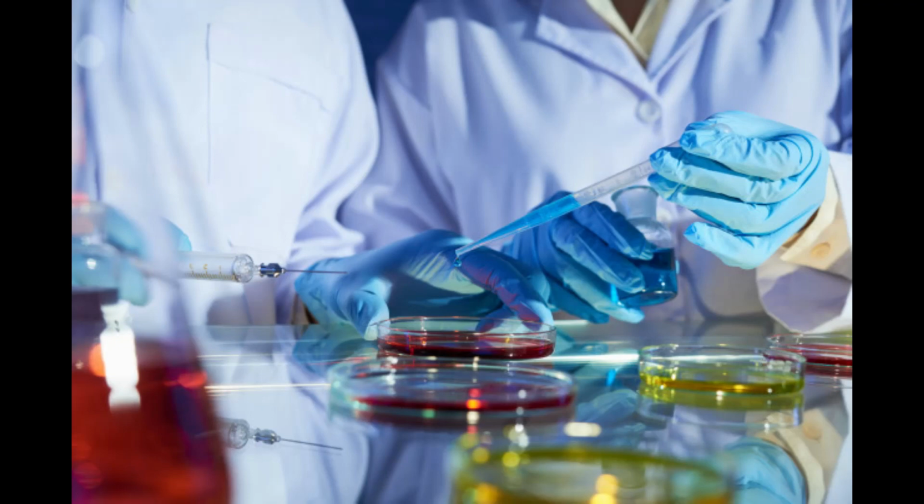After we incubate this, and once you grow it, you're going to have a lot of growth here, probably a lot of growth here, less growth here, and you're going to have individual colonies growing here, where you'll be able to see if it's just Serratia or if you have Serratia and some other stuff in here too. They'll be spread out enough that you'll be able to tell that.